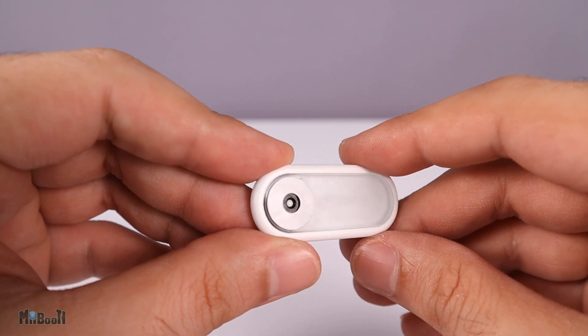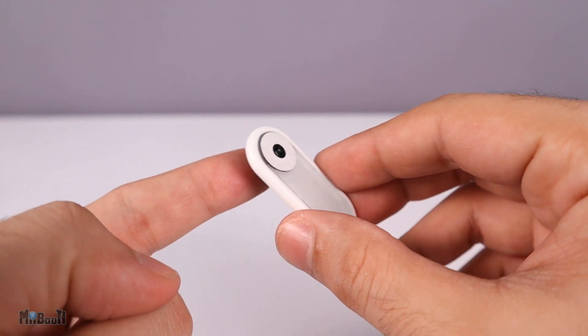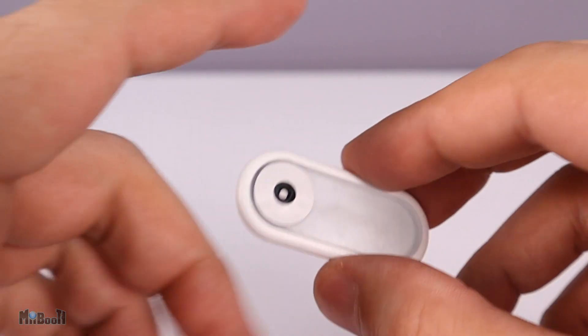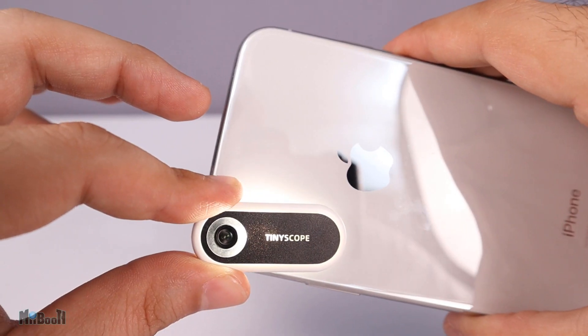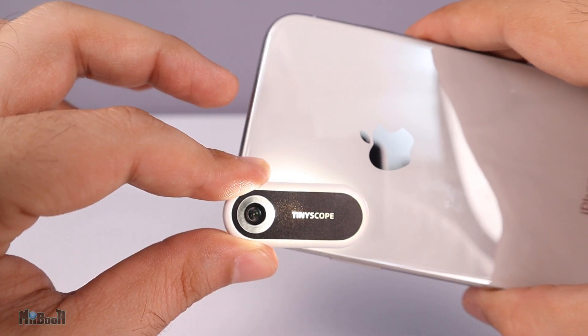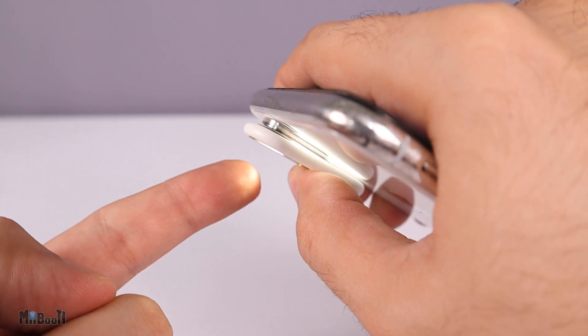The remaining area is made of translucent, matte frosted clear plastic — and this is very clever. Since this is a macro lens that has to go up close to view a subject, it would normally block the light. But when you stick it on the camera, the flash shines through the clear ring on the front side, illuminating the subject clearly.